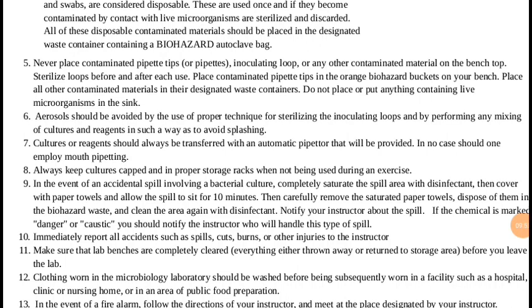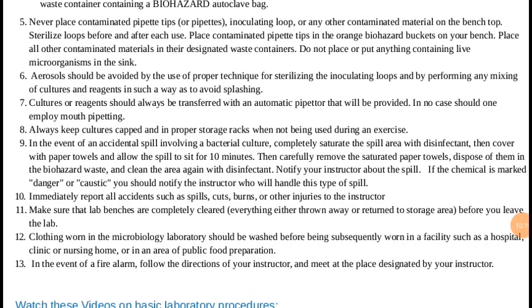You should place the contaminated pipette tips in the orange biohazard buckets on your bench. That is if your laboratory can manage. You should place all other contaminated materials in their designated waste containers. Do not place or put anything containing live microorganism in the sink, because they could grow. Maybe they could be washed down into the sewage, they continue growing, and then they'll be recycled back.